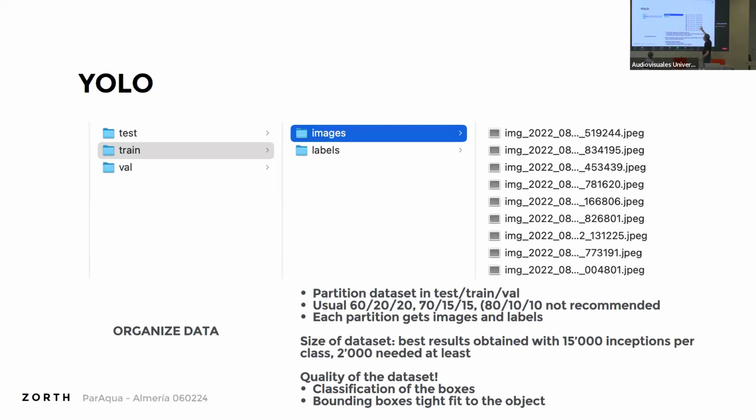And those are the coordinates of your boxes in every single image. Very importantly, for YOLO, you don't need a nothing class, because anything that has not been labeled as an object is nothing. So the YOLO will be really great at detecting nothing.